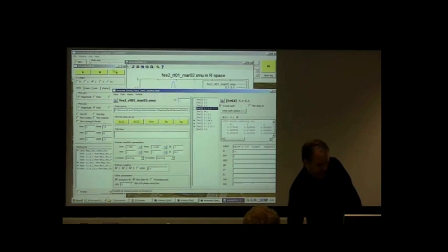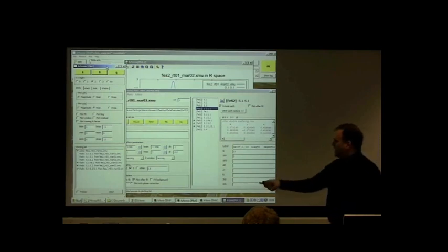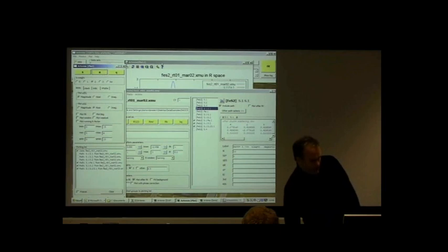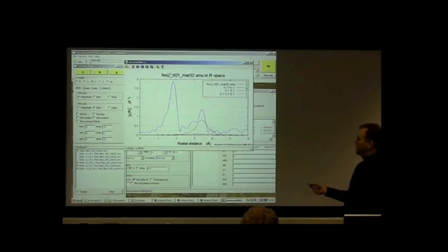And now we're going to make a plot of the data and those 3 multiple scattering paths. And this will be something kind of interesting. So 2 of them are really tiny. These 2 are even smaller than those 2 there. These are quite small contributions to the data.